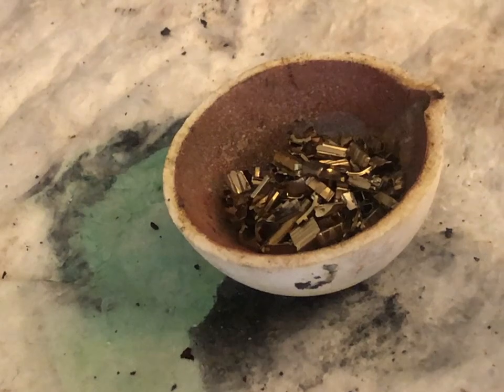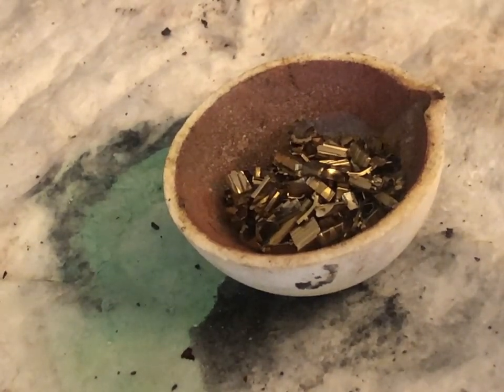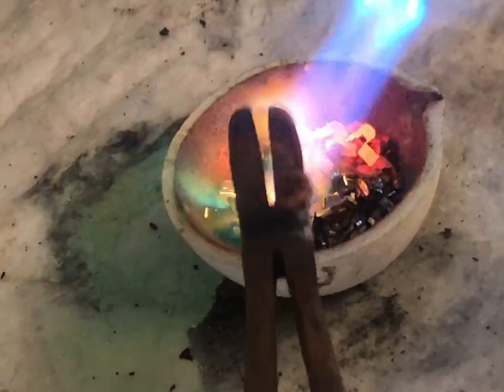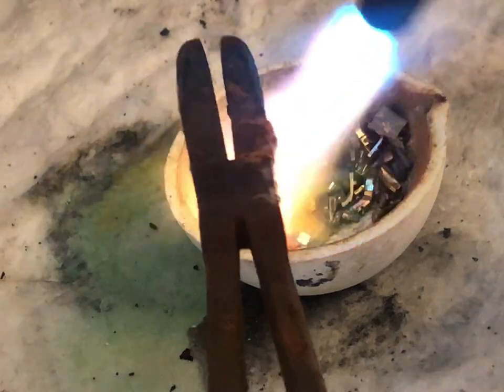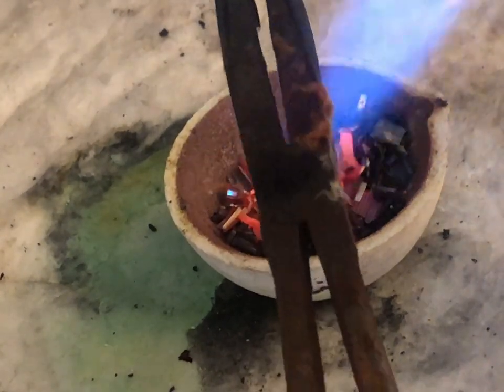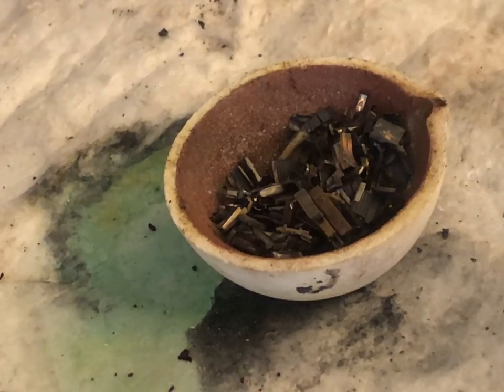Anytime you work with refining gold-filled material, you always want to heat it up a little bit — you want to incinerate it. You want to get it until it turns red, basically, to melt off any organics. I'm going to heat it up, keep heating it, and then we're going to put it in some dilute nitric acid.